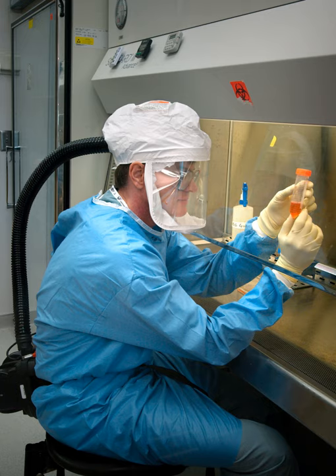Topic: Maintenance and service. Cabinets need to be maintained on a regular schedule. During this certification check, the airflow and the filter capacities are verified. The filters have a limited lifespan, determined by the air quality within the laboratory space and the amount of particles and aerosols generated inside the BSC work zone.